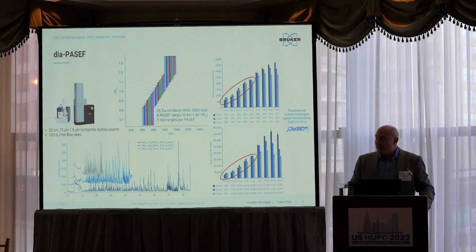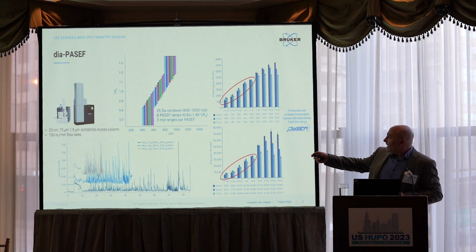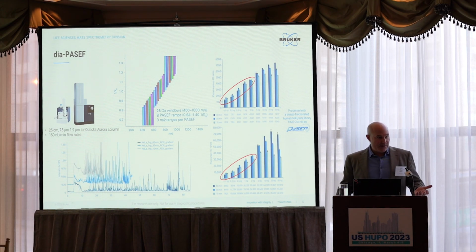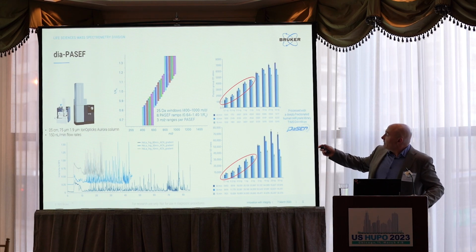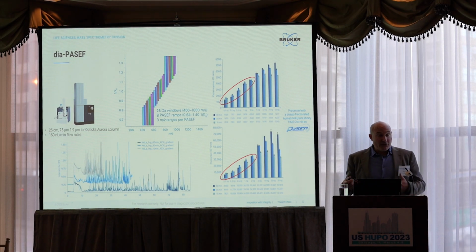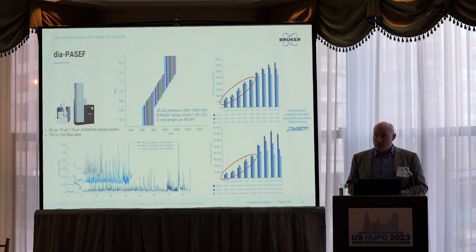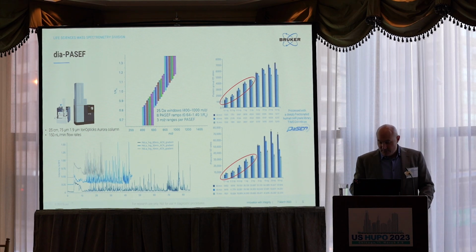So we tested this with multiple gradients at very low loads, and I think that you guys will appreciate what we ended up finding was that at very low loads, gradient length doesn't give you a big advantage, right? So it trends to about a nanogram or 2, and then going out longer gives you a little bit of advantage, but at these very low loads, there's very little advantage going longer. So 15-minute gradients, 30-minute gradients, somewhere in this range is quite acceptable to get the full proteome advantages.